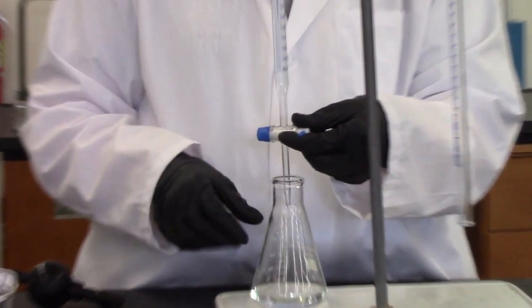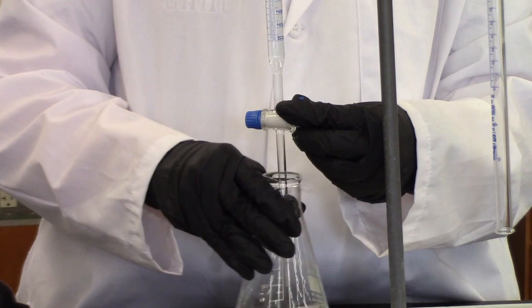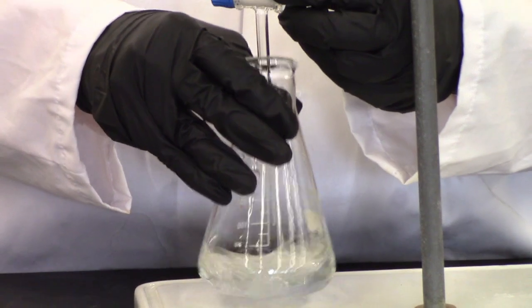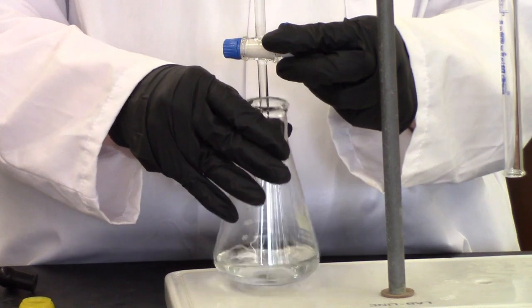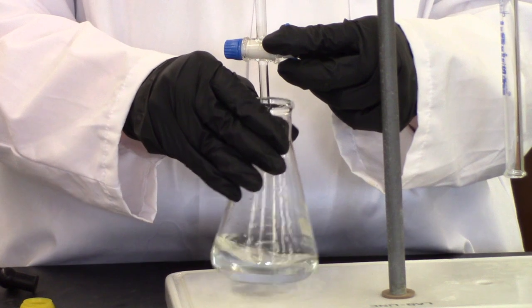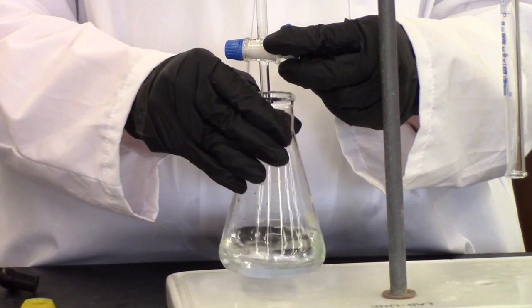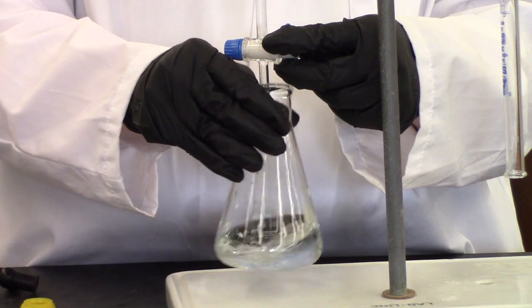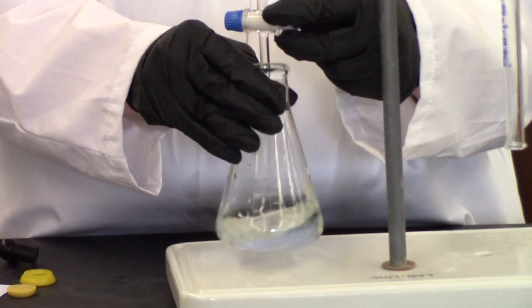So when you first add your base to your acid, you're not gonna see anything. So if we can zoom in close and look at this. I mix it as I'm adding. You're gonna have to play around a little bit with where your hands are and which hands do what, okay? But as you start, you're not gonna see anything. It seems like nothing is happening. I caution you to be patient, okay? The first time you do the titration, it can be kind of rough, so I'm going pretty quickly at this point. And what I'm looking for is where pink clouds start to form. Once I see that, I slow down, okay?